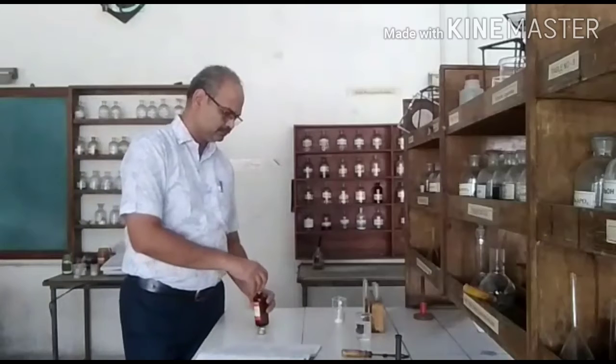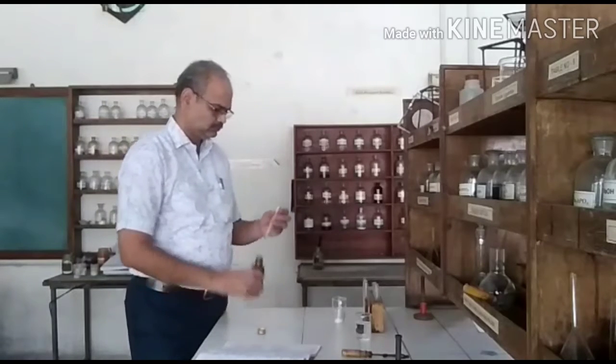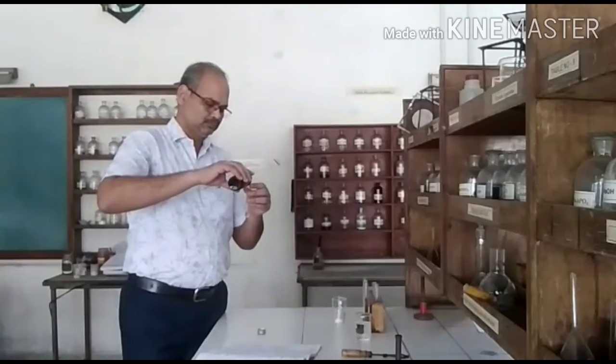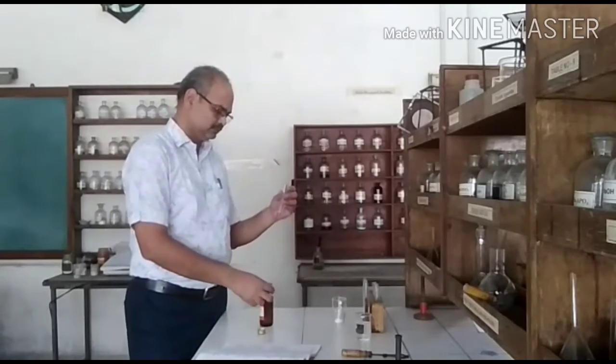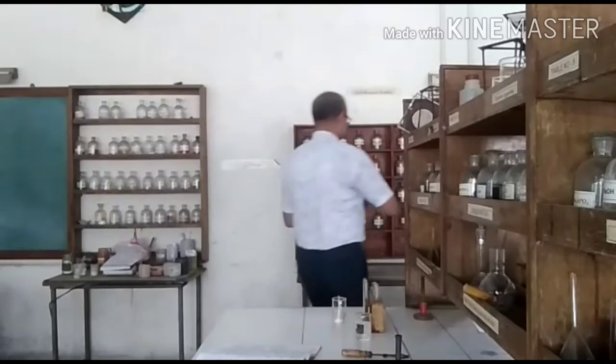I'll just open it, and I will add little phenolphthalein in the OS. I will keep the bottle back in its place.